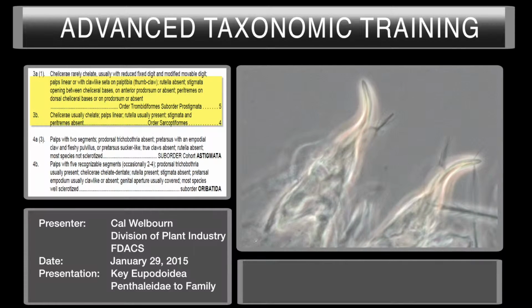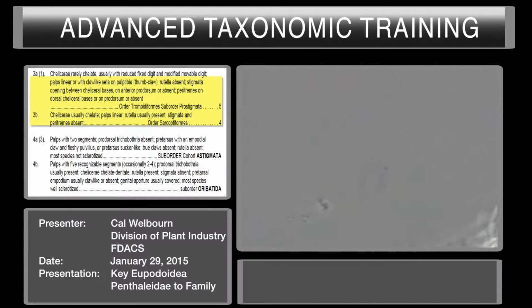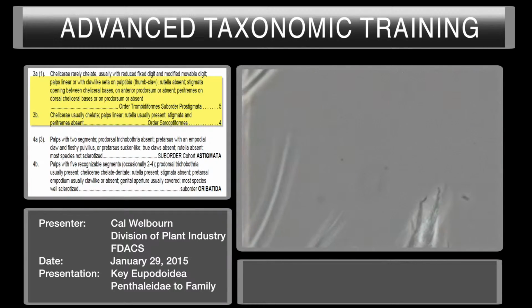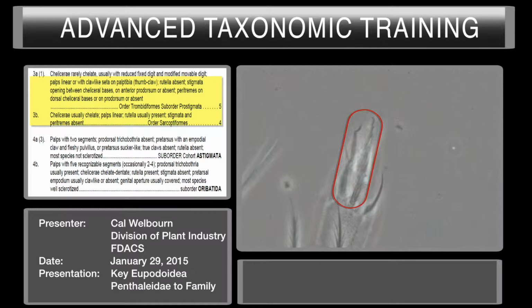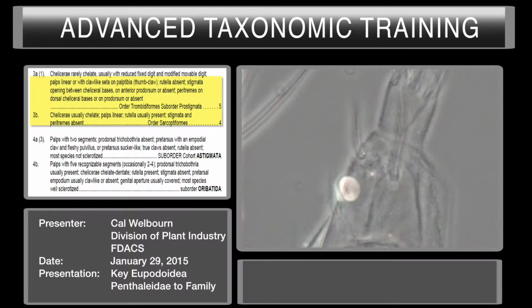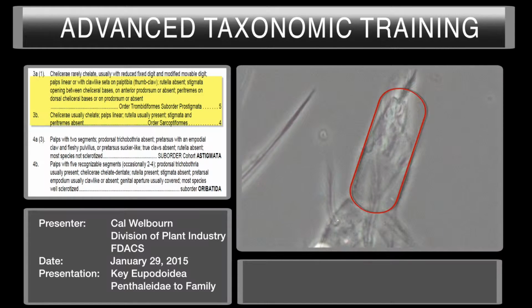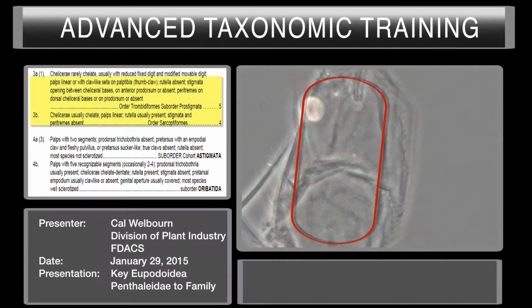Looking at the palps. Now here are the palps. This is the palp tarsus. Actually, this is probably the palp tibiotarsus. We have few segments. This is another segment on the palp. This is the rest of the palp. So it's a linear palp with some few segments.